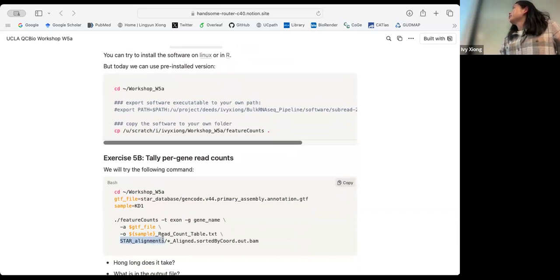So what we can do is just do this once for both of them. Sample here is more of a name you give the output, but you can use any name, basically. It's just a placeholder. We're going to run it twice, one with KD1, one with SC1, but the coming line of code will merge the two tables together.